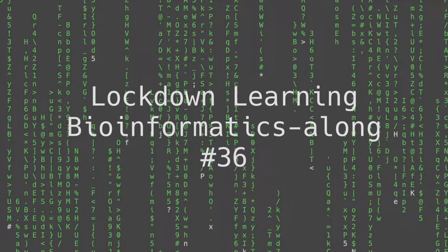Really, what the R package is doing is looking up data on the Biomart website.